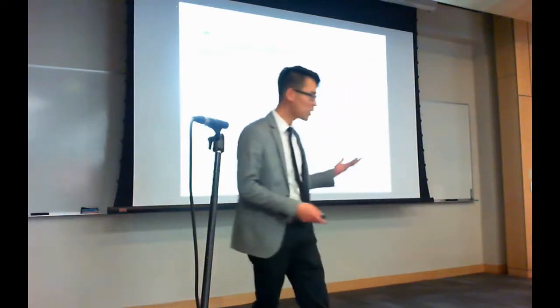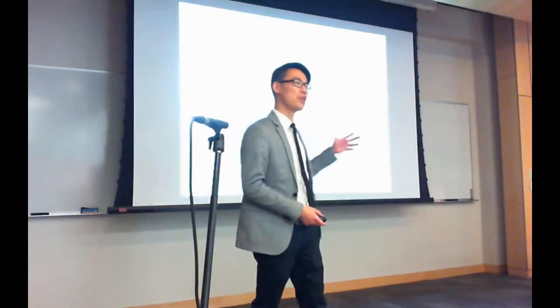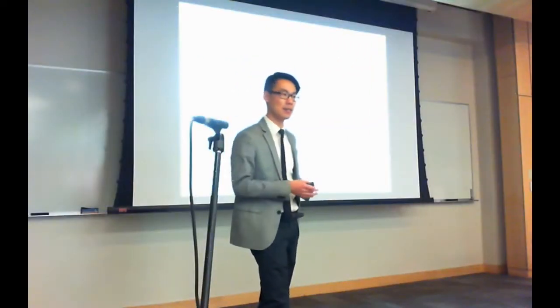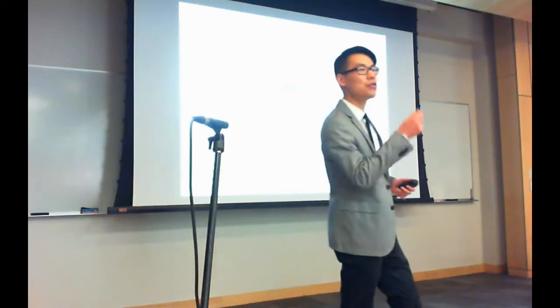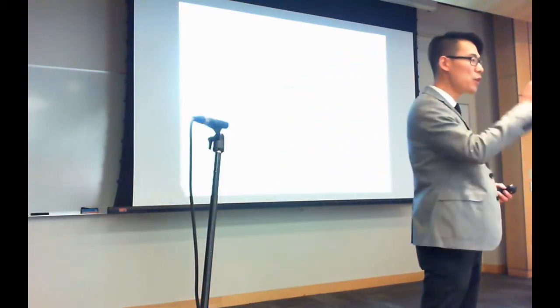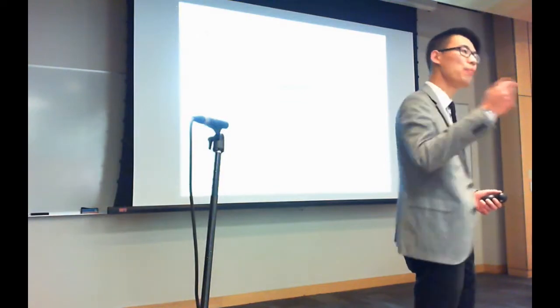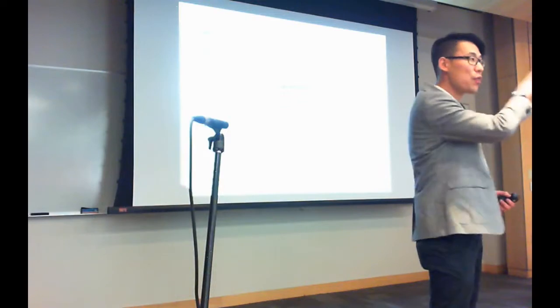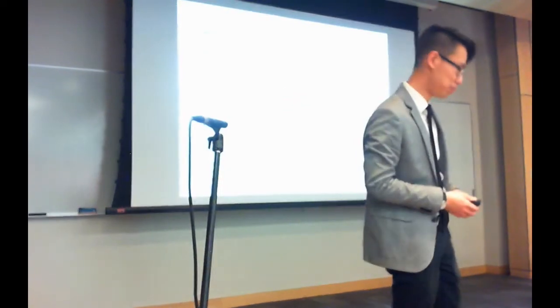And so to actually identify new spectra, new compounds in a sample, if we have a bunch of these query spectra that we have no idea what the identity is, we can compare them to library spectra, and if they are similar, then we can do an annotation transfer from the library spectrum, because we know what the library spectrum is, and say, look, in your sample, this spectrum is this structure.